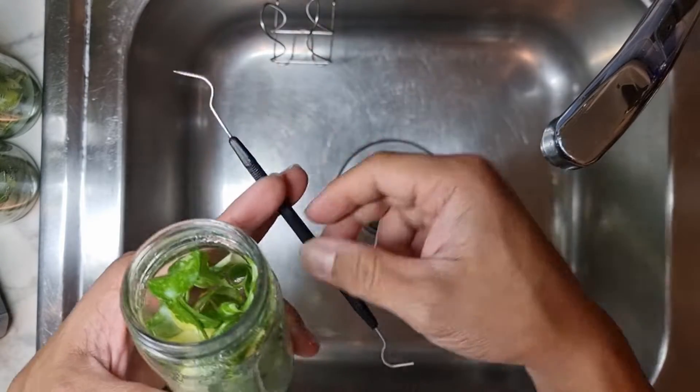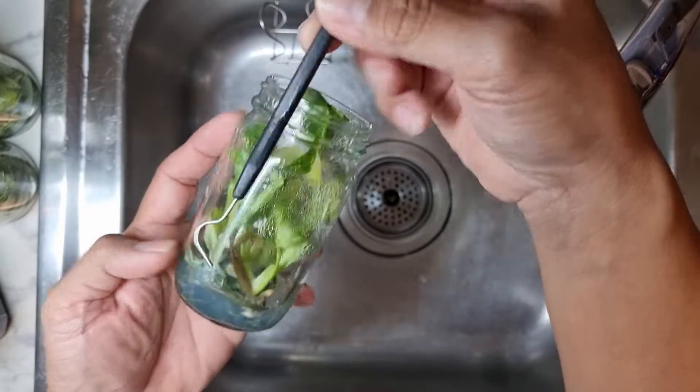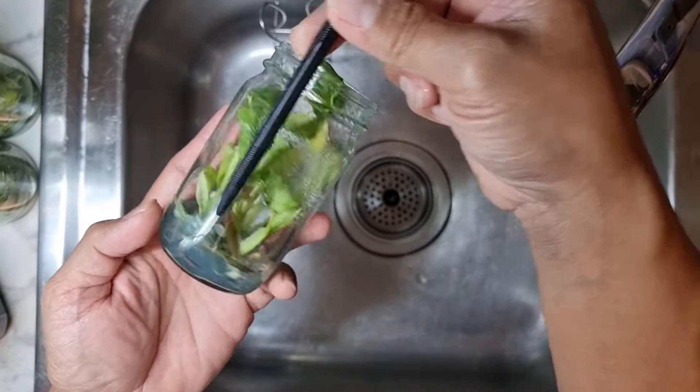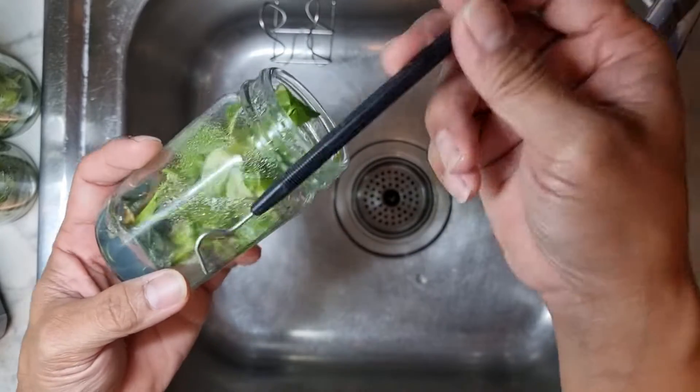You can probably use a stick or make your own hook, something like that. I like to hook them and pull them out, or use this to break the agar so I can easily pull them out one by one.